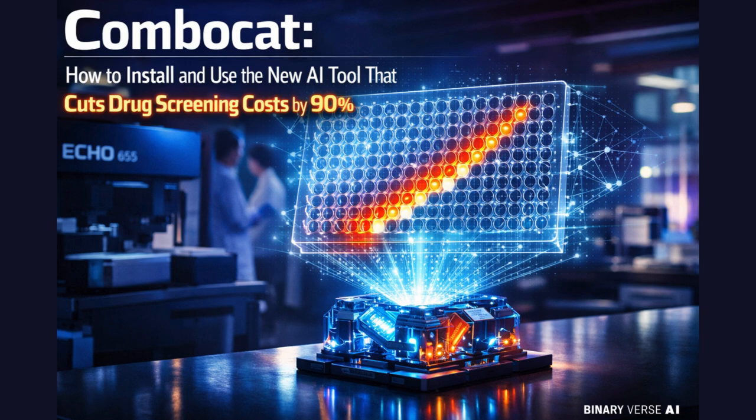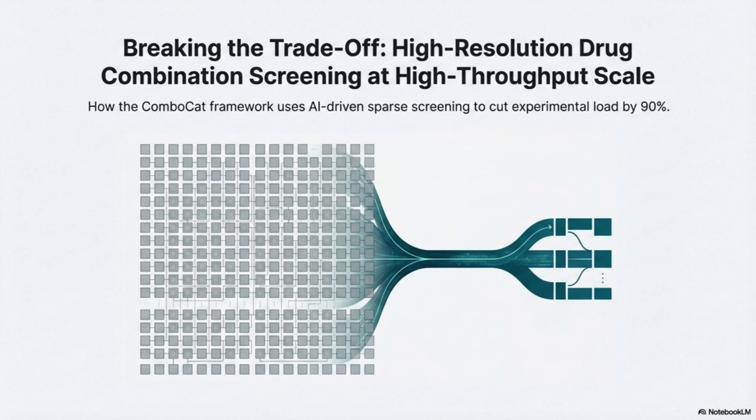You gave us the sources, and our mission today is to really get into one of the most practical tools we've seen in modern drug discovery, Combocat. We're looking at how this open source framework completely tackles a classic bottleneck in combination screening.